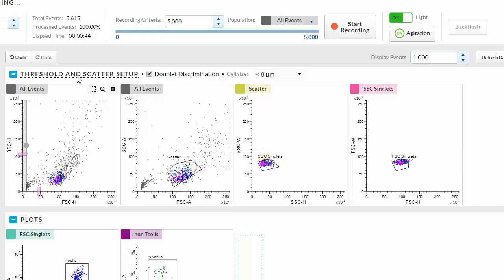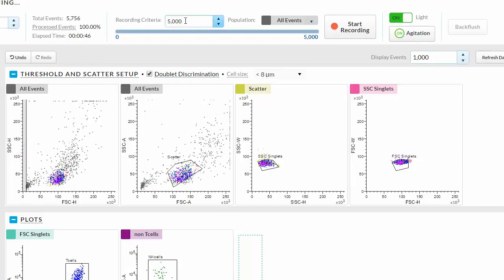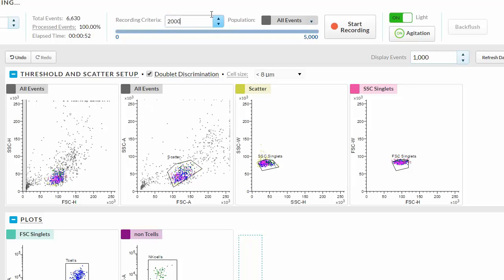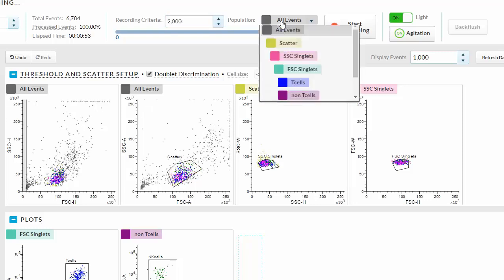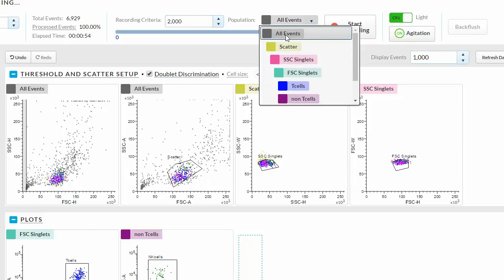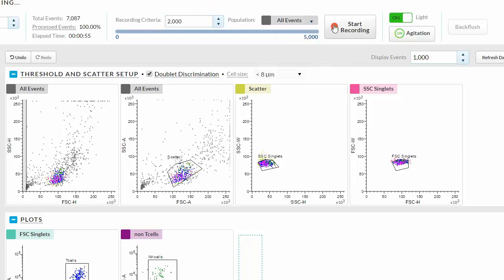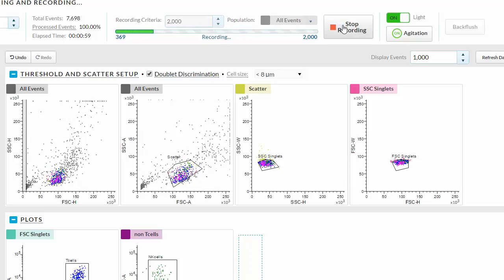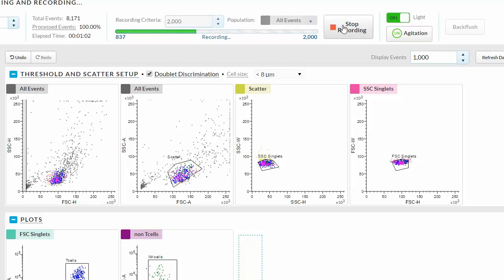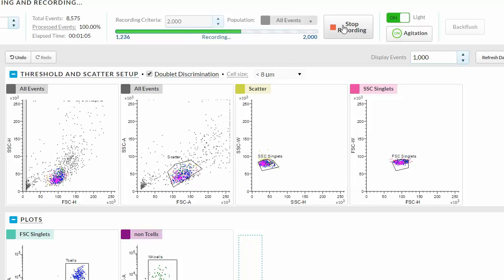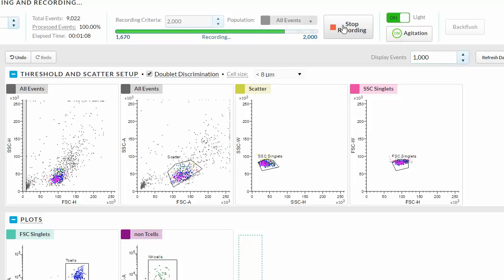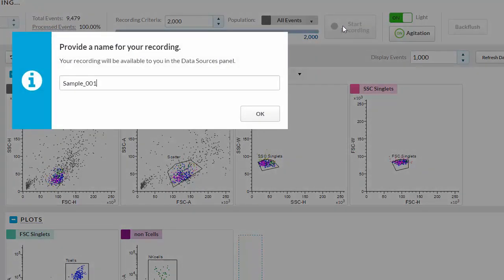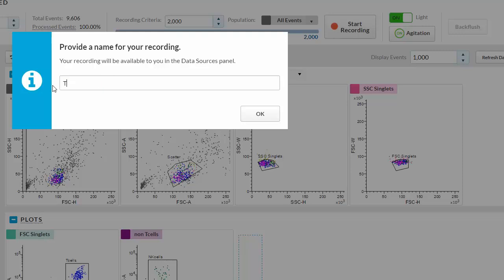To record a data file of the pre-sort sample, select the recording criteria. Choose the population and click Start Recording. The progress updates and when the data file is saved, you can provide a name for your recording.